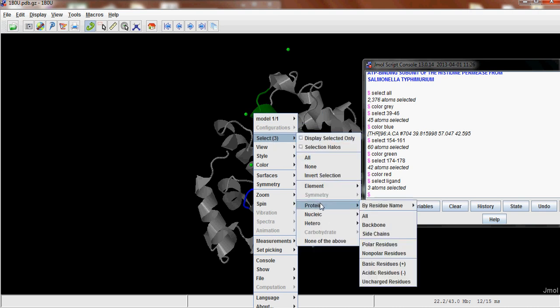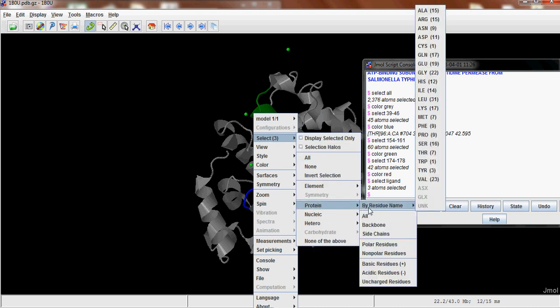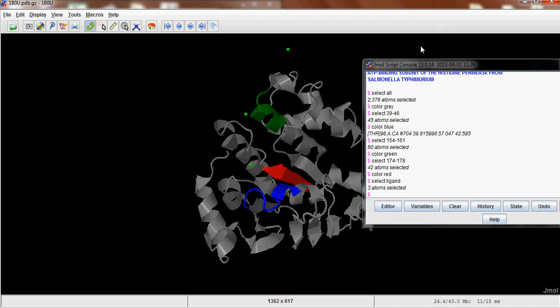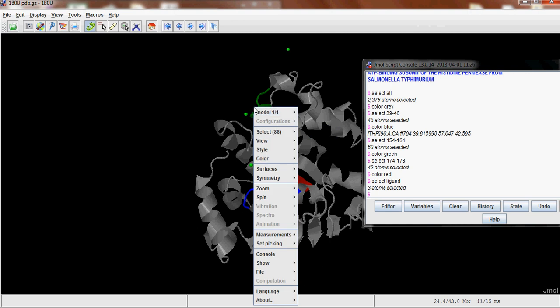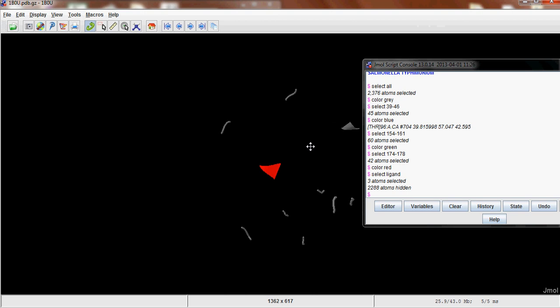And then right click again, Select, Display Selected Only. So now you have only the aspartate residues.